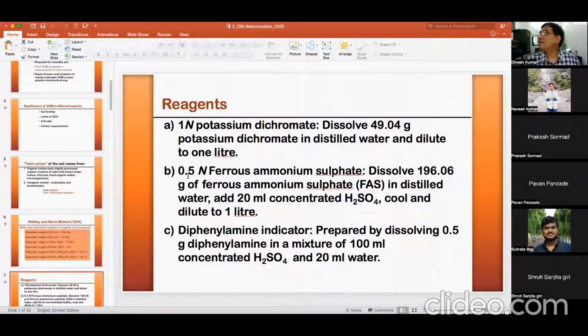Potassium dichromate. I'll show you. We prepared some solution for you, and also we will show you some, because you are not in the lab, so you can at least see something. So 0.5 normal means N by 2 also. 0.5 normal means half of the gram equivalent weight.